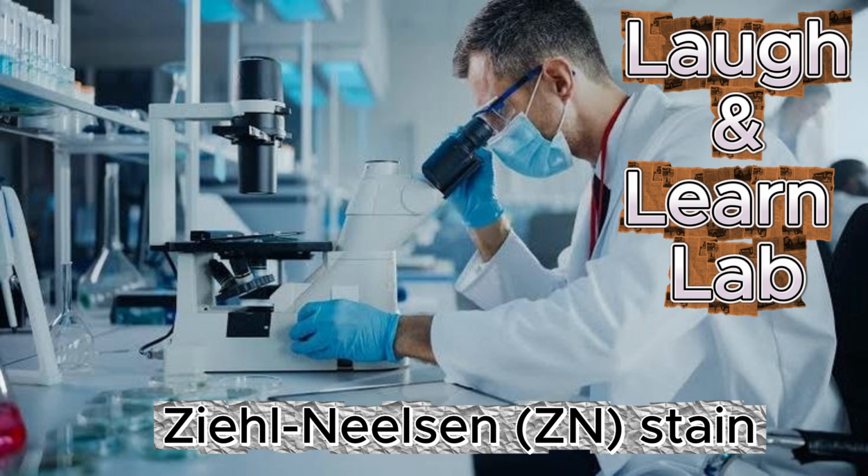First, Carbol Fuchsin stains the bacteria red. Heat helps the stain penetrate the waxy bacterial wall. Acid alcohol removes the stain from ordinary bacteria, but acid-fast organisms retain the red color. Finally, methylene blue provides background contrast.